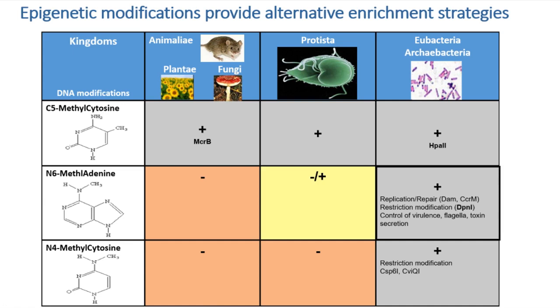And the reason I consider this to be important is that almost all rare event biology is about signal and noise. And what you're looking at here are signals that are often not present in one kingdom or one biology state versus another. And so if you have a good tool for fishing out that signal and you have essentially no noise in your background, you've got a really good tool for doing an enrichment.